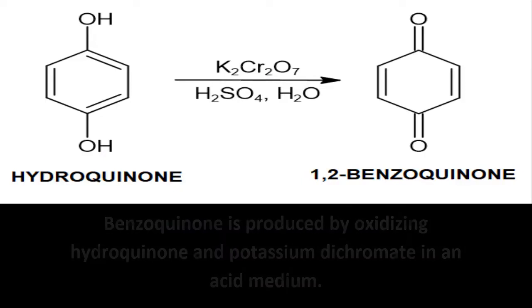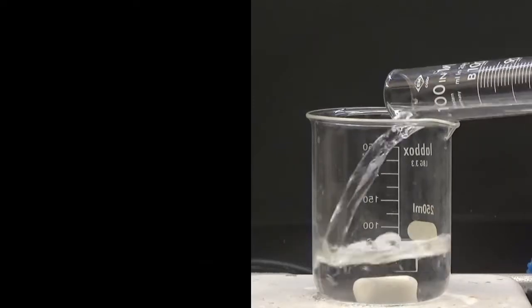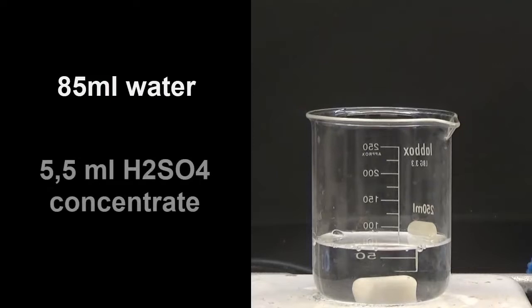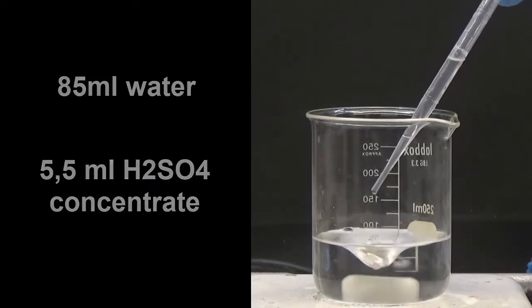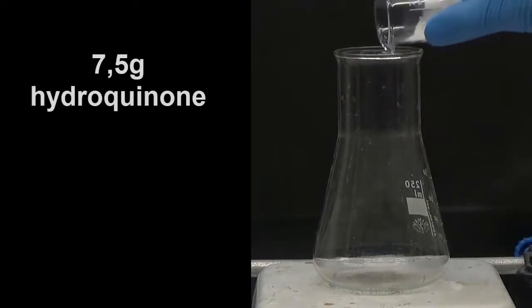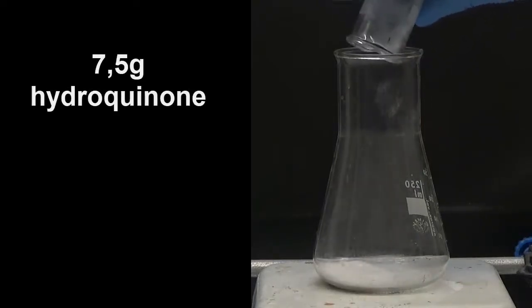To get benzoquinone, we prepare diluted sulfuric acid by dissolving 5.5 milliliters of concentrated acid into 85 milliliters of water. In a 250 milliliter Erlenmeyer flask, we place 7.5 grams hydroquinone and dilute with the sulfuric acid.